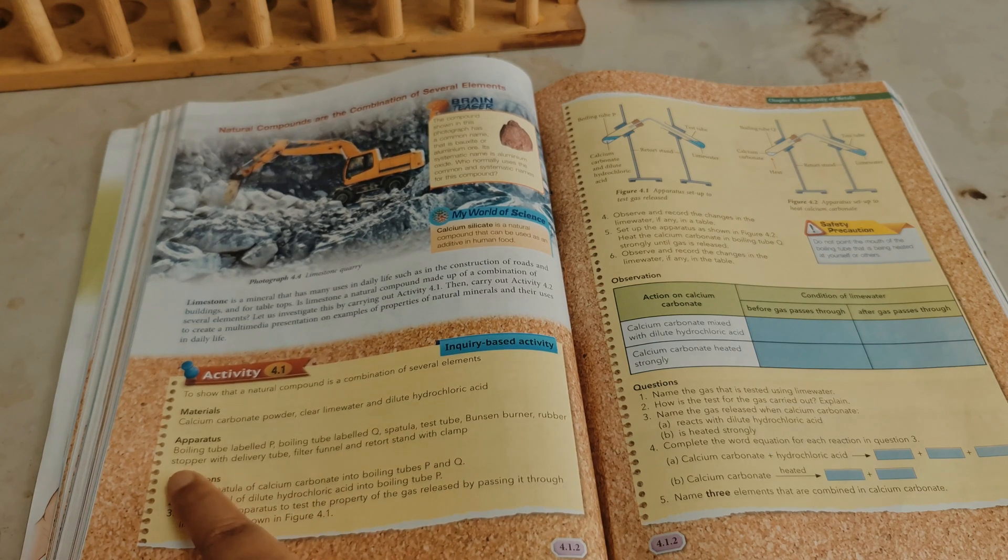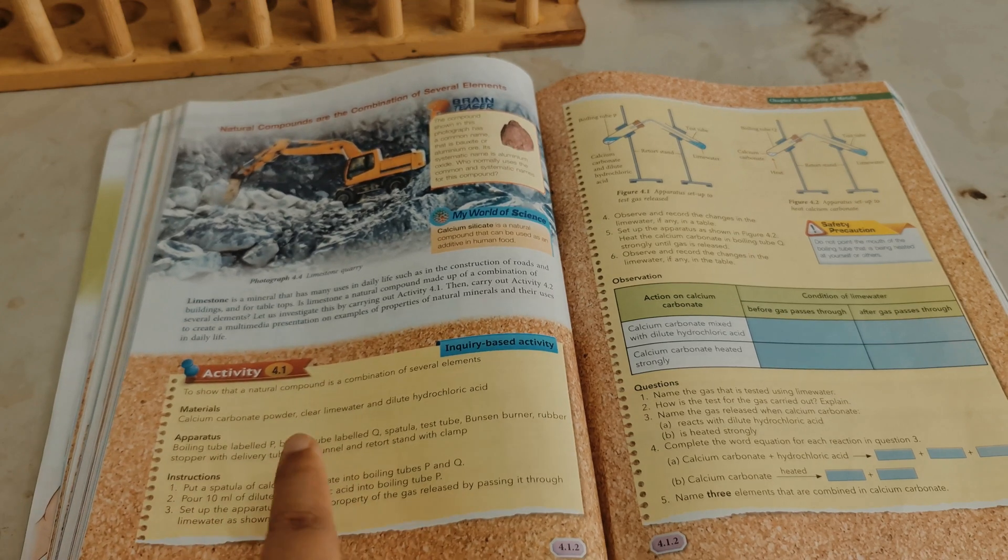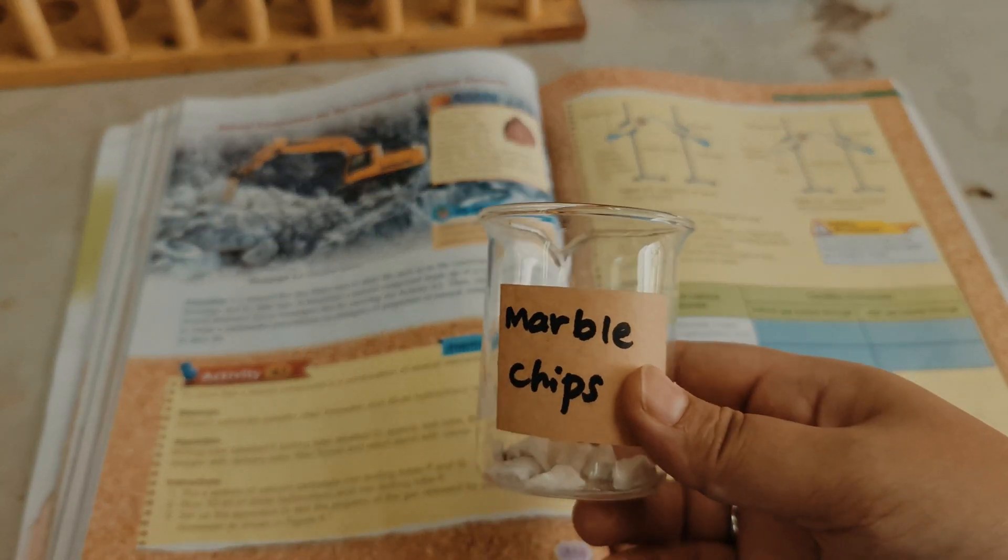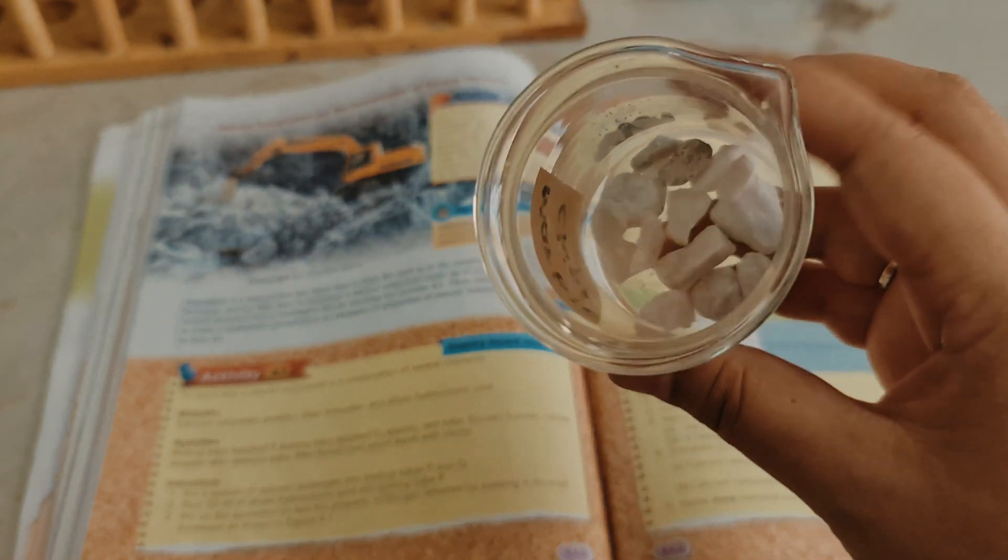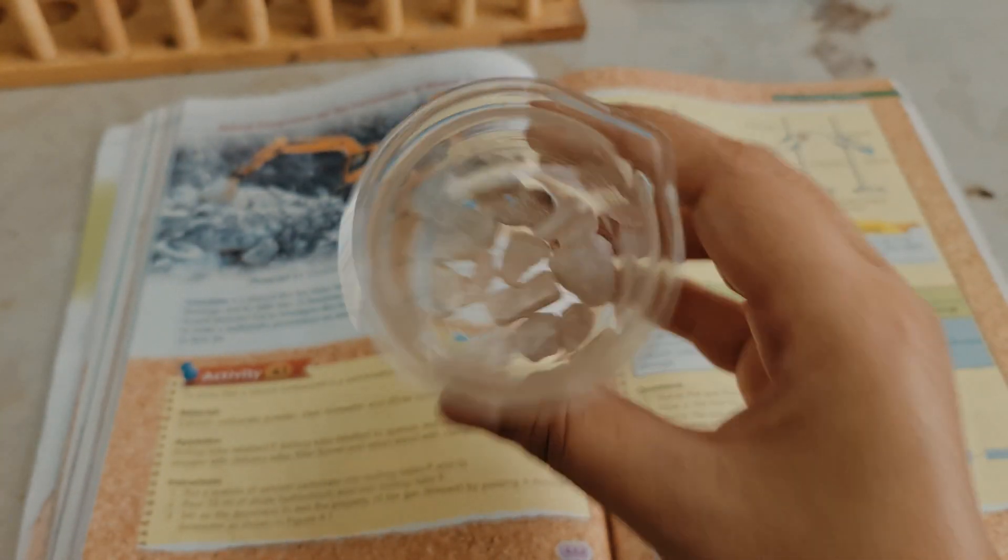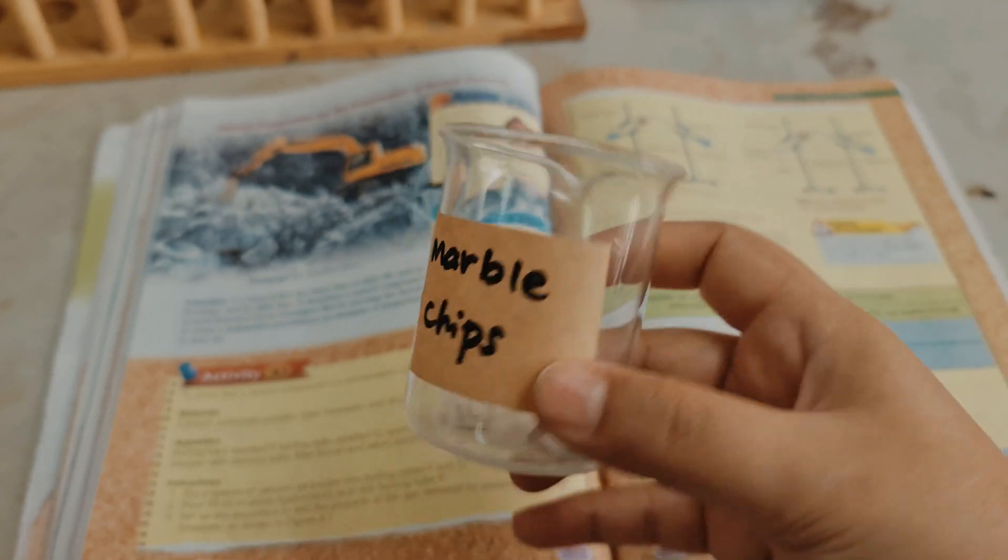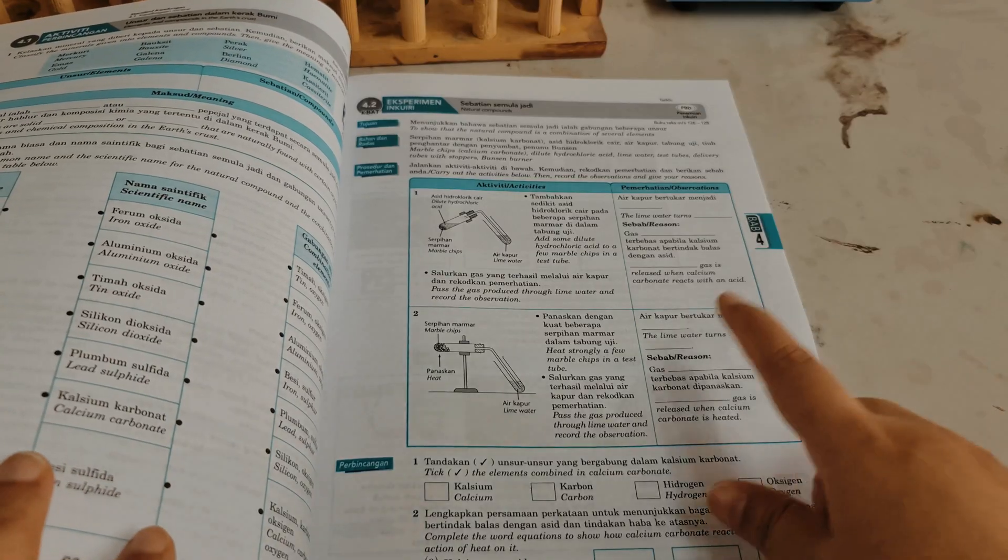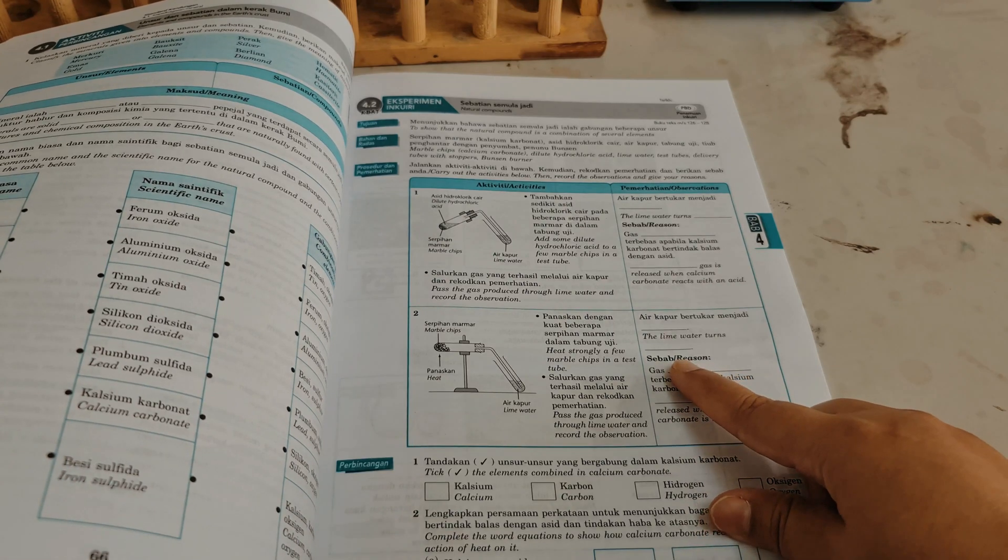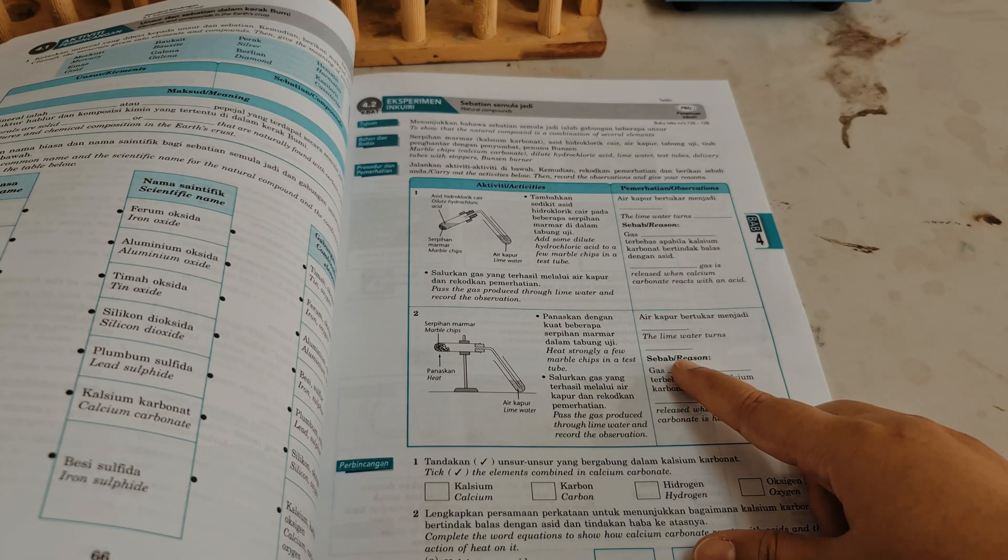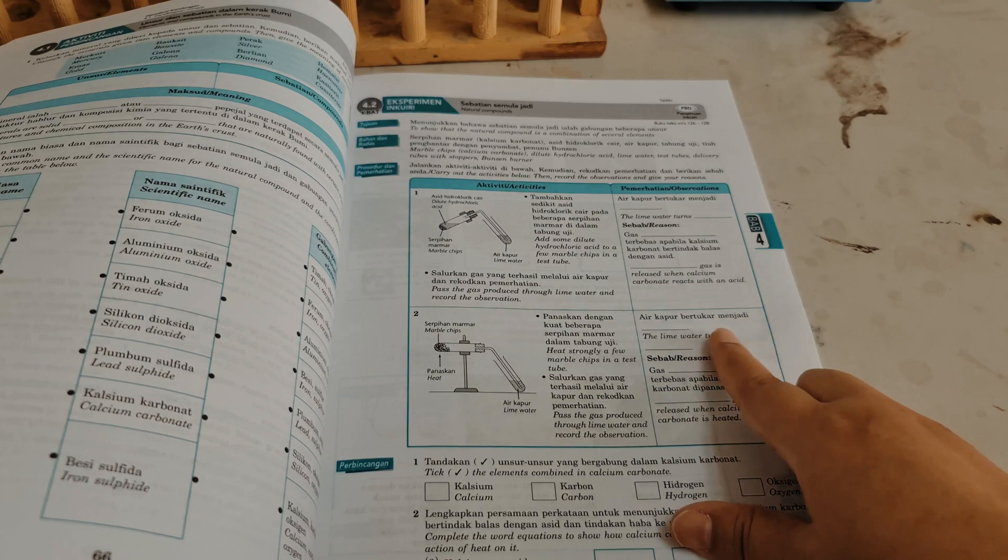So these are the materials and apparatus that you need, but we are going to change the calcium carbonate powder with some marble chips, like so. We are going to follow the steps in the science process skills book because it's going to be a lot easier for our students to use.